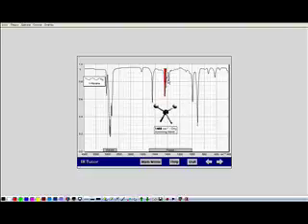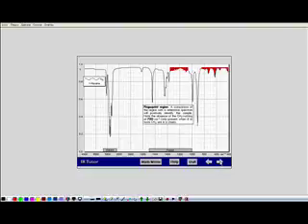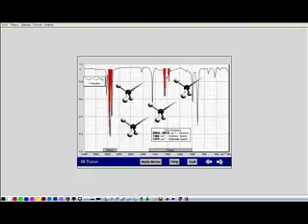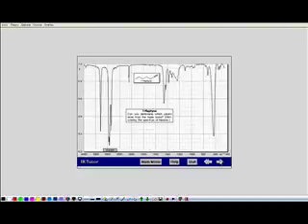But there was a time in the not too distant past that you had to know all these things. And then you get some out-of-plane bends like that, where it's flapping, and we don't need to know these. But when I took spectroscopy as an undergraduate, which was a long time ago, I had to know all of those stupid motions, and I didn't learn them very well. But infrared was much more important than it is now.